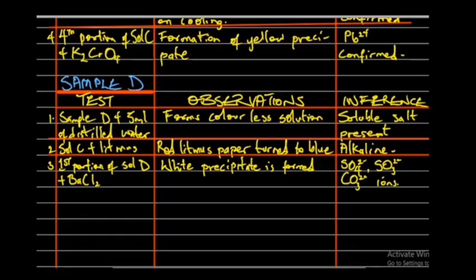And then we checked again, adding dilute HCl. When we added dilute HCl, we discovered that the precipitate remained insoluble.